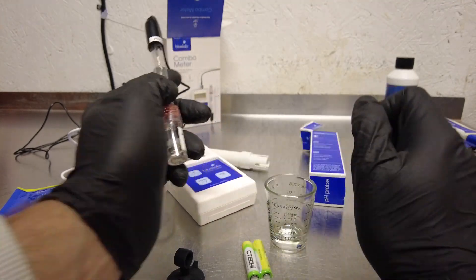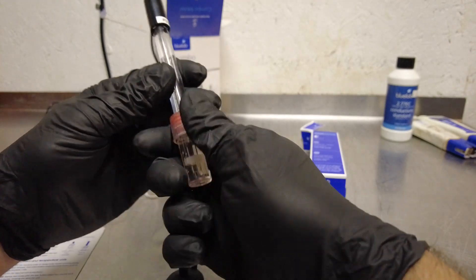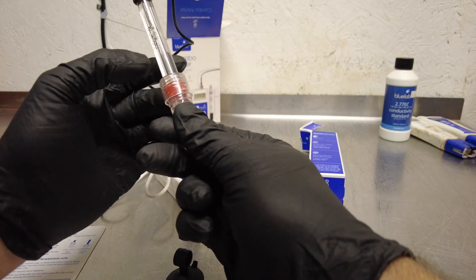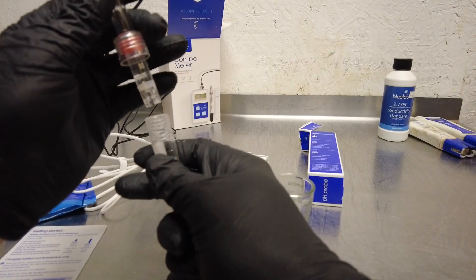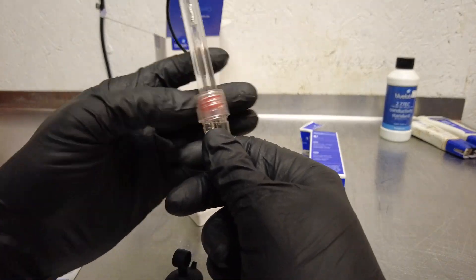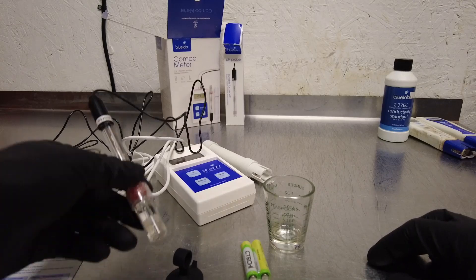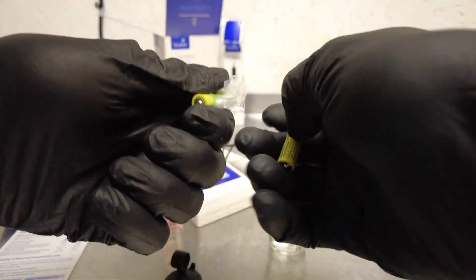This is basically just a twist-off cap as well — I'll pinch and twist off the bottom. There's your probe, you can see it's dripping wet from the storage solution. The EC probe doesn't need any kind of storage solution, so you're simply just dipping it in. You don't have to calibrate it, which is a great thing.